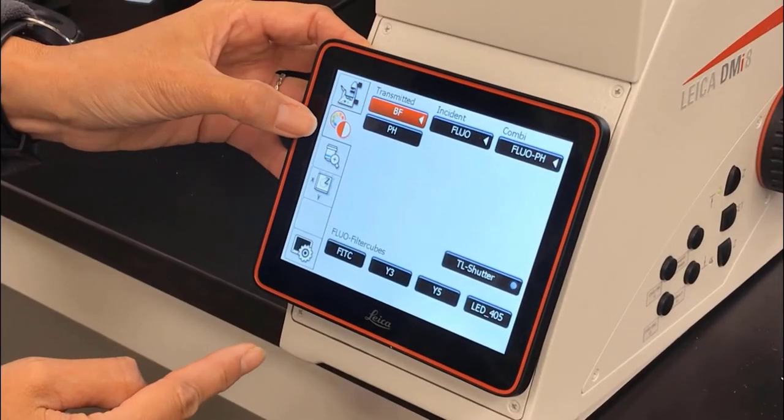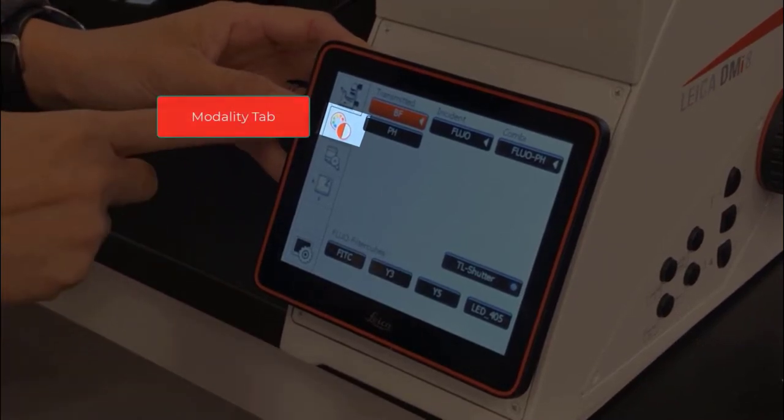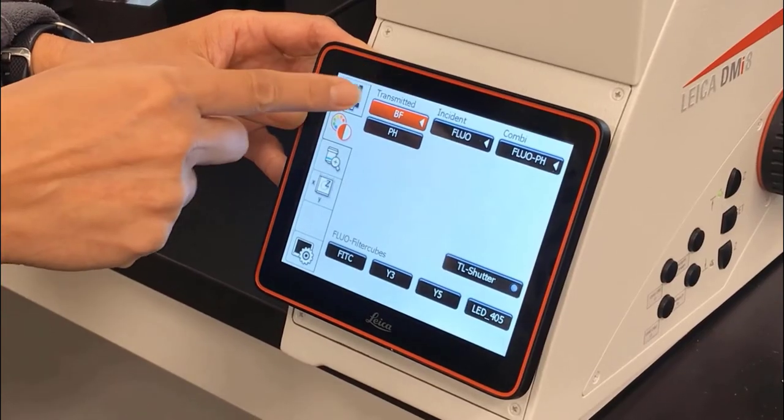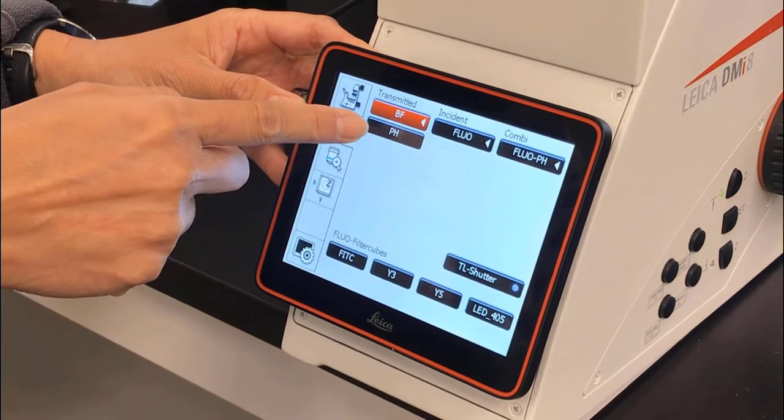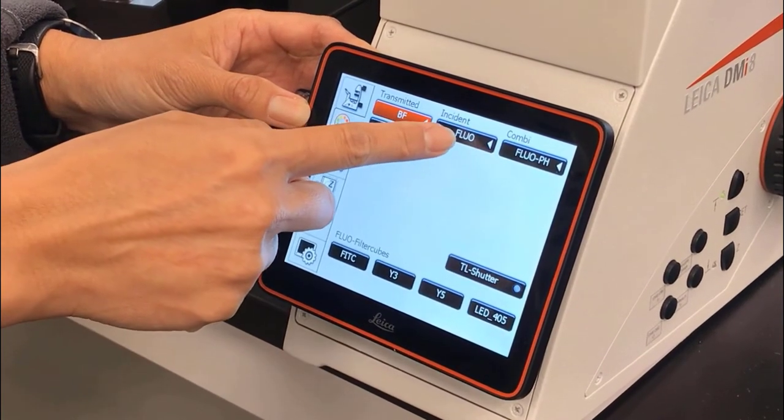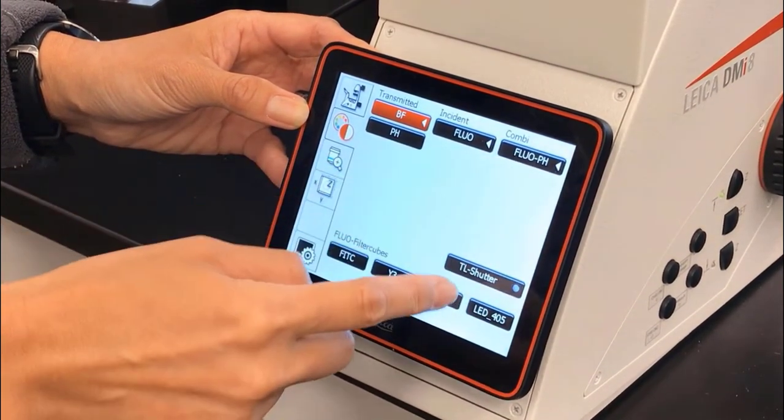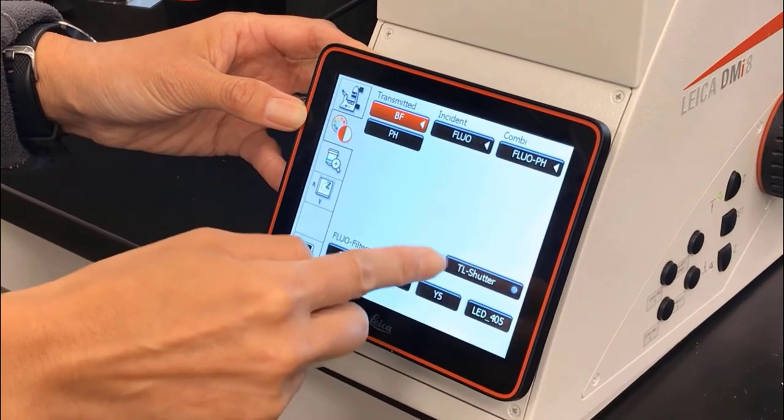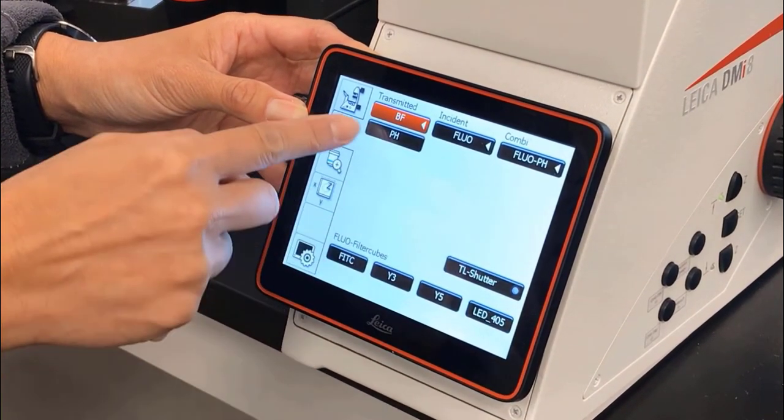The next tab is our contrast or modality tab. Here we can choose between transmitted light, bright field and phase, fluo and fluo phase. We can also open and close the shutter here.